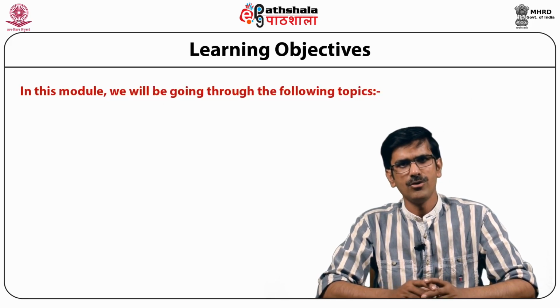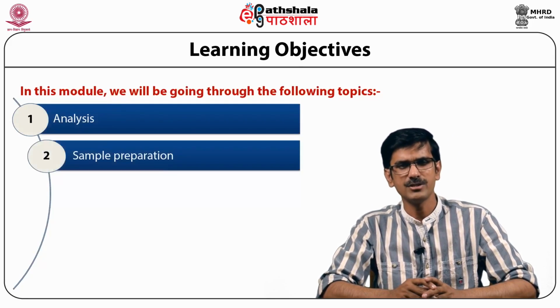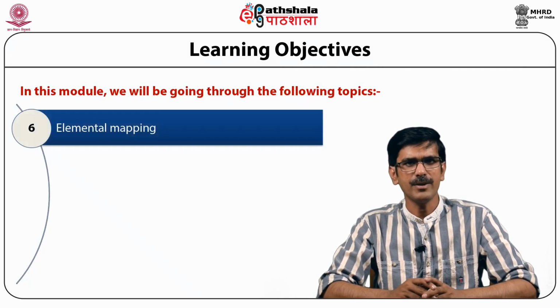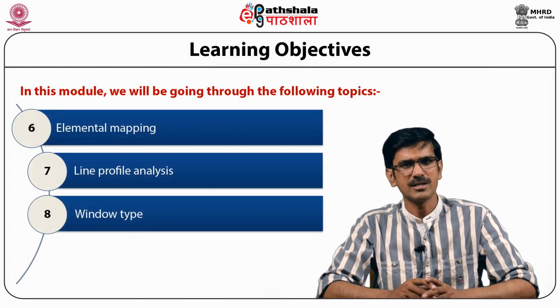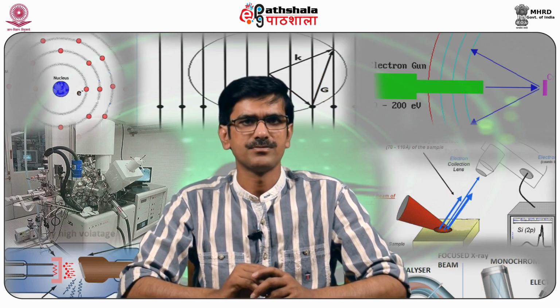In this module, we are going through the following topics. Number 1, the analysis, then sample preparation, data interpretation, qualitative analysis, quantitative analysis, elemental mapping, line profile analysis, window type, and lastly, the graph interpretation. So, let's start with the analysis part.